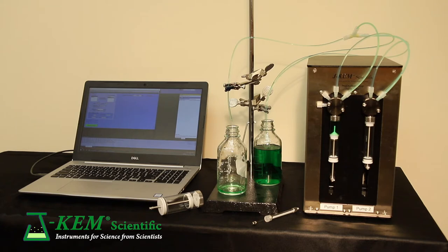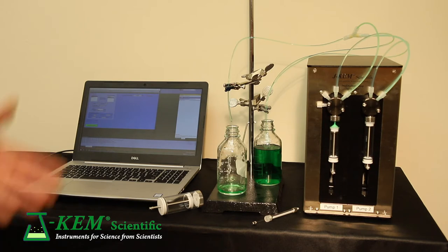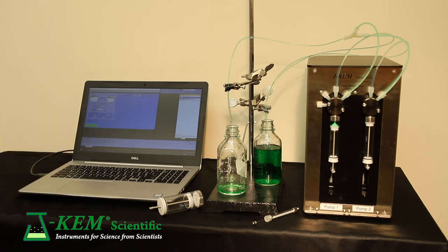When it's empty, it shows another key feature of J-KEM's syringe pump system. The pumps automatically refill. So I can ask a 10 milliliter syringe to deliver a total of 25 milliliters.